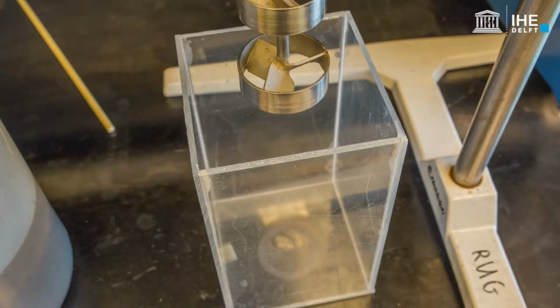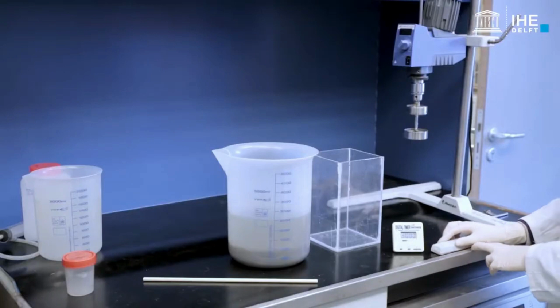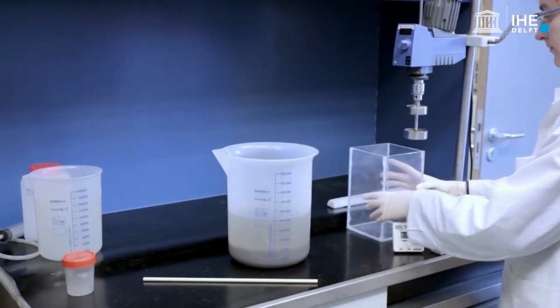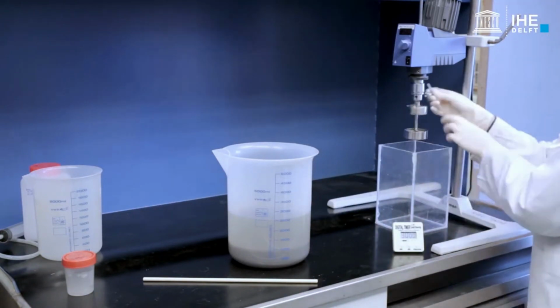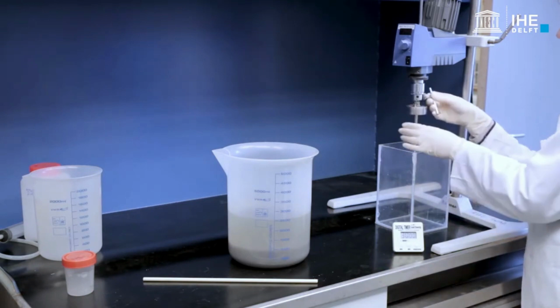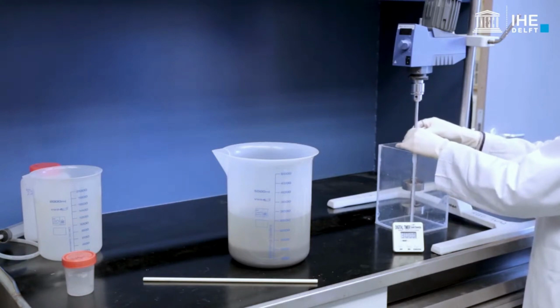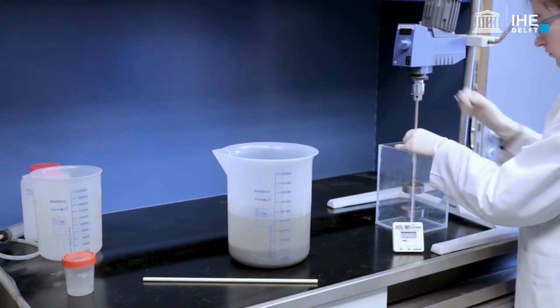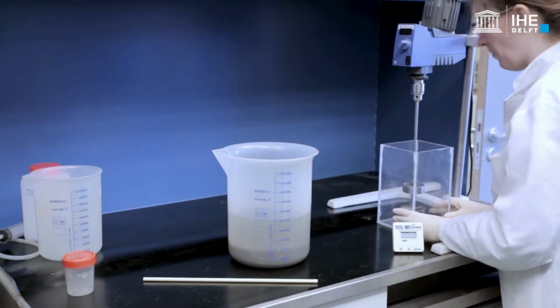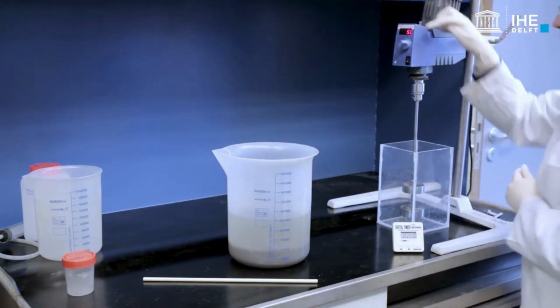It is important that the jar is square to avoid the formation of a vortex during mixing. Place the mixer into the square flocculation jar. Bring the mixer down to the correct height to avoid dead zones during the mixing phase, and preset the mixing speed at 50 RPM. Prepare a siphon for supernatant sampling by connecting a tube to a syringe.